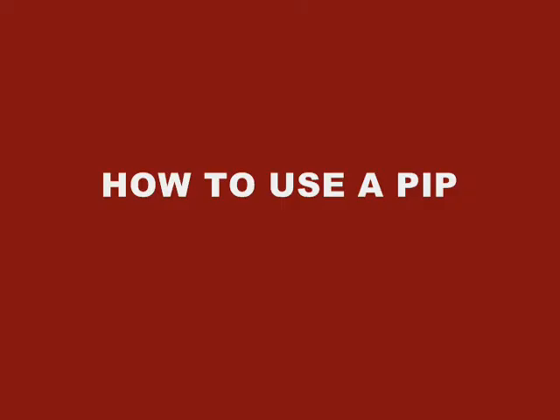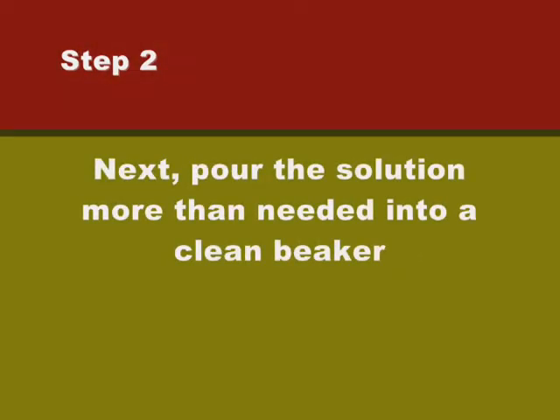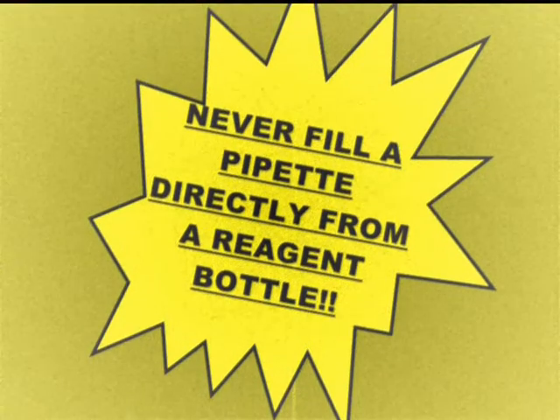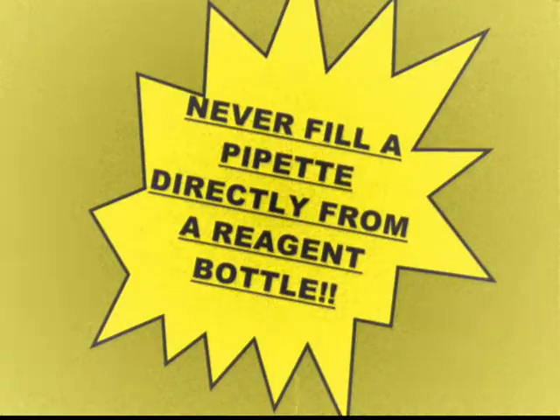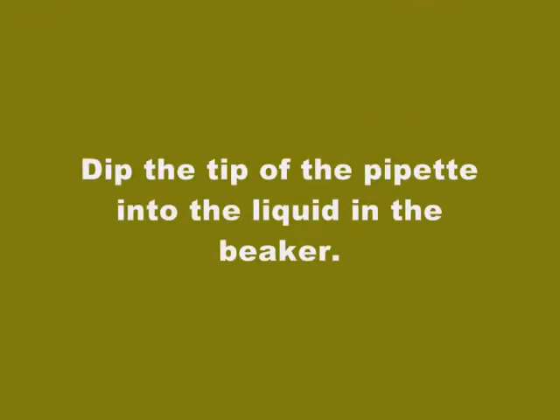How to use pipette. Clean and rinse the pipette with the solution to be transferred. Next, pour the solution more than needed into a clean beaker. Never fill a pipette directly from a reagent bottle. Dip the tip of the pipette into the liquid in the beaker.